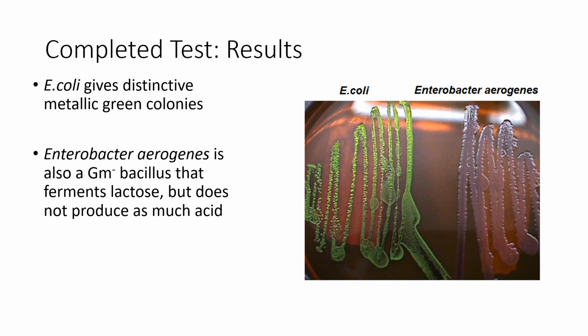Hey, dirt's everywhere. So once again, I'm looking at EMB here, which has two special dyes that react specifically with E. coli. Remember that EMB agar has two sugars, lactose and sucrose. And remember, sucrose is a disaccharide. So is lactose. There's actually, really technically 4 monosaccharides in there, right? And so there's a lot of fermentable ability there. And so E. coli will give you a lot of acids from that, giving you this metallic green.